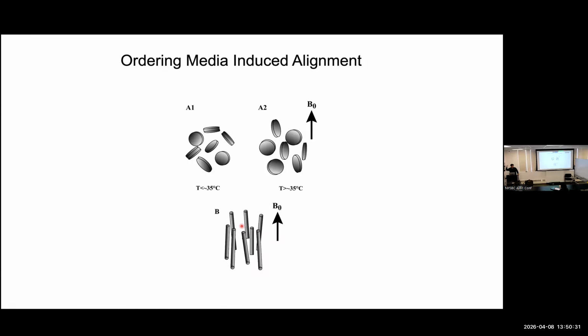Normally the bicelles are very concentrated, so concentrated that your alignment is basically solid. The trick was to take that down to a dilute sample, because the way you tune alignment is the amount of wall, the concentration of the ordering medium. You can literally titrate up or down by titrating the concentration of either the phage or the bicelle. And bicelle came first, the phage came second.